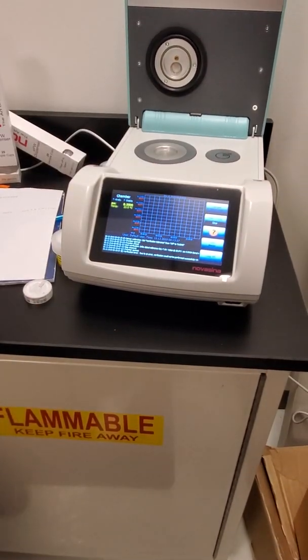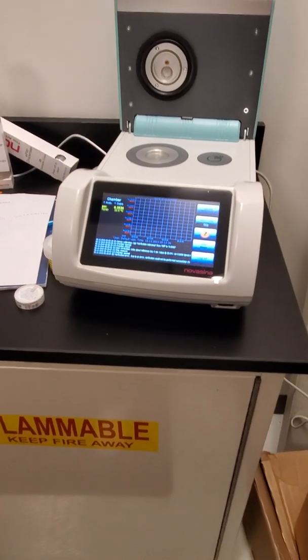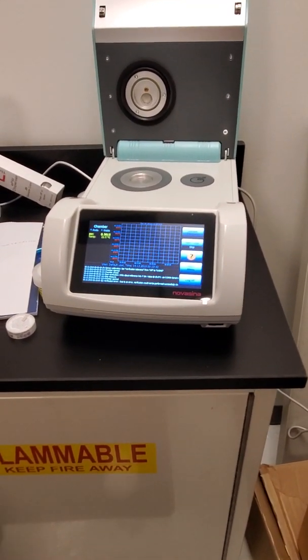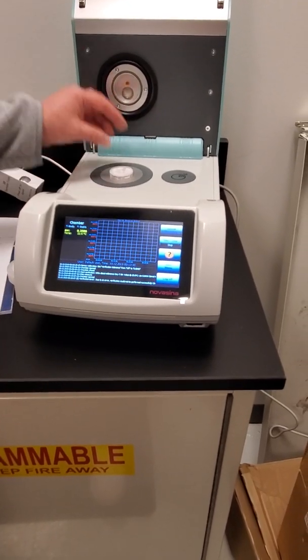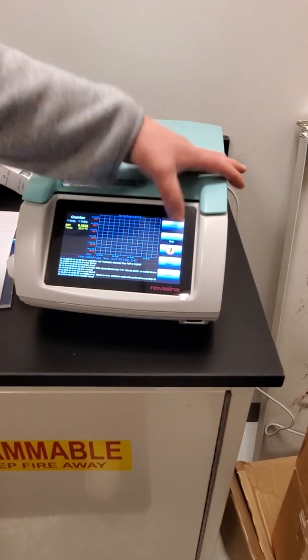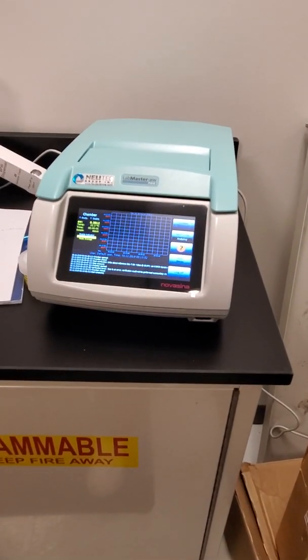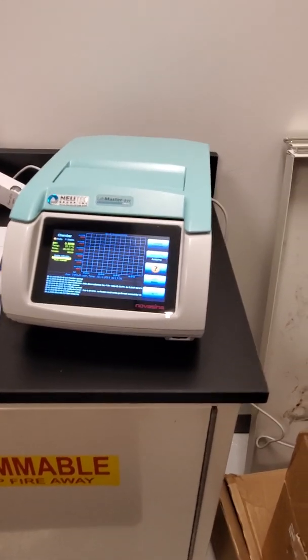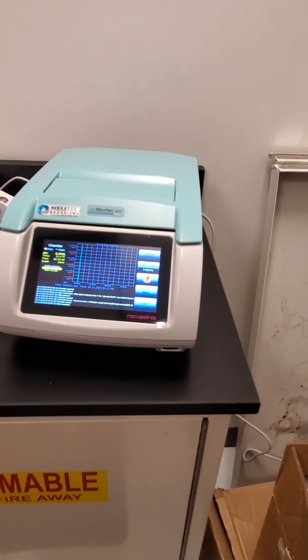So most times you'll be on this screen, and like I say, it's constantly keeping track of whatever's going on. And then you would come in, you're going to read your sample, put it in, close the lid, hit start, and then you can walk away. And it'll beep, like I say, when it's done. You should be able to hear it if you're in close proximity.